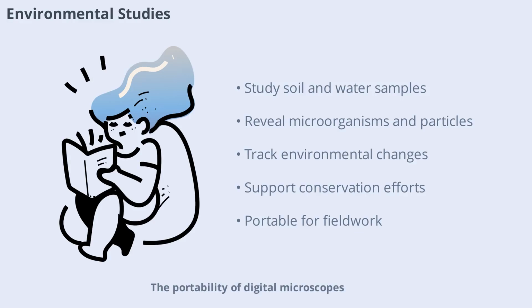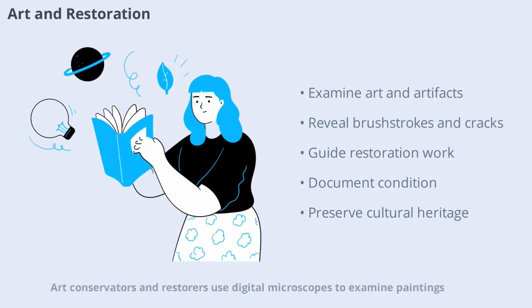The portability of digital microscopes allows for fieldwork in diverse locations, making them valuable tools for environmental monitoring and research. Art conservators and restorers use digital microscopes to examine paintings, sculptures, and artifacts.